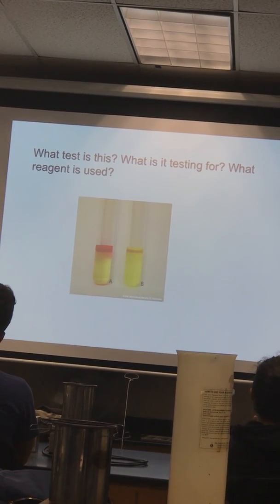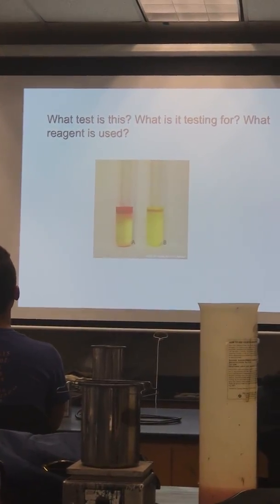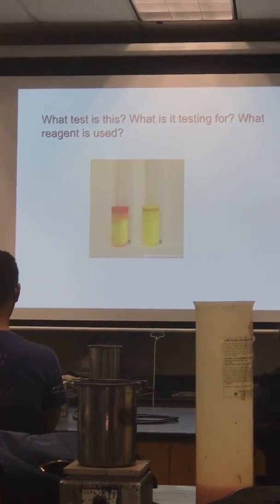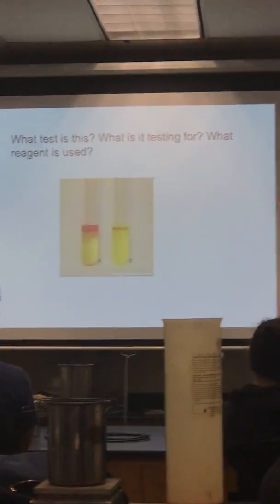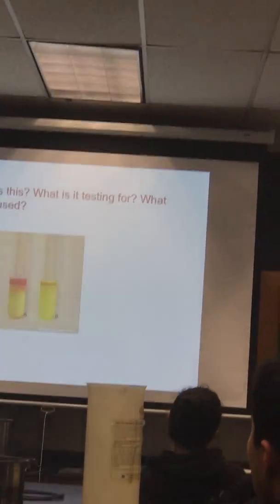What test is this? Yeah, how do you know it's an indole test? Because the reagents stay on top, okay? What's it testing for?